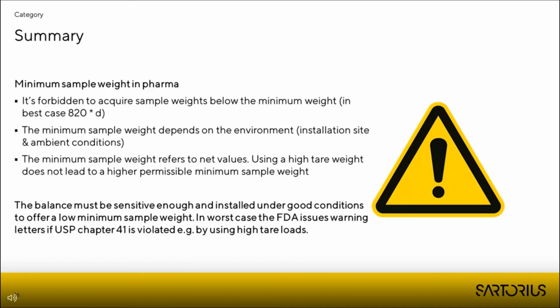Instead, the balance sensitivity must be high enough and the balance must be installed under good conditions to offer a low minimum sample weight. Using vessels with high tare weight is not a solution, and in worst case, the FDA issues warning letters if USP Chapter 41 is violated.